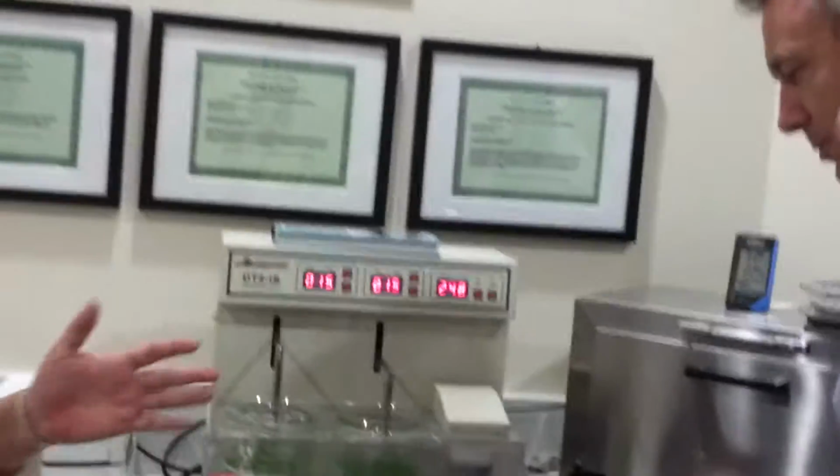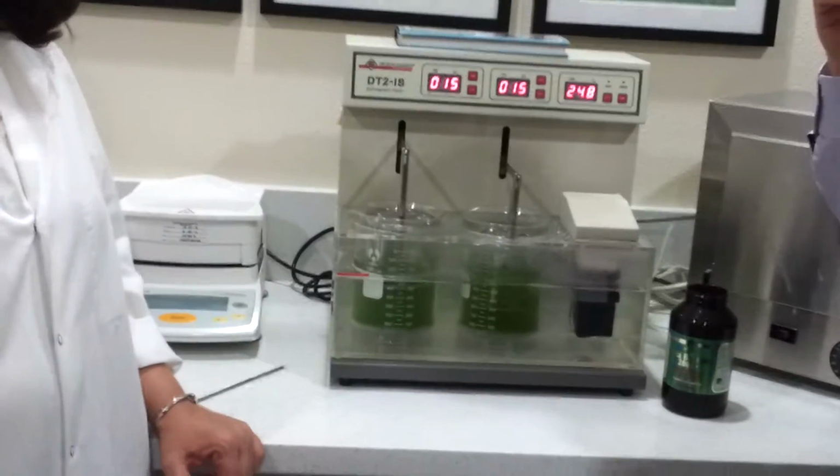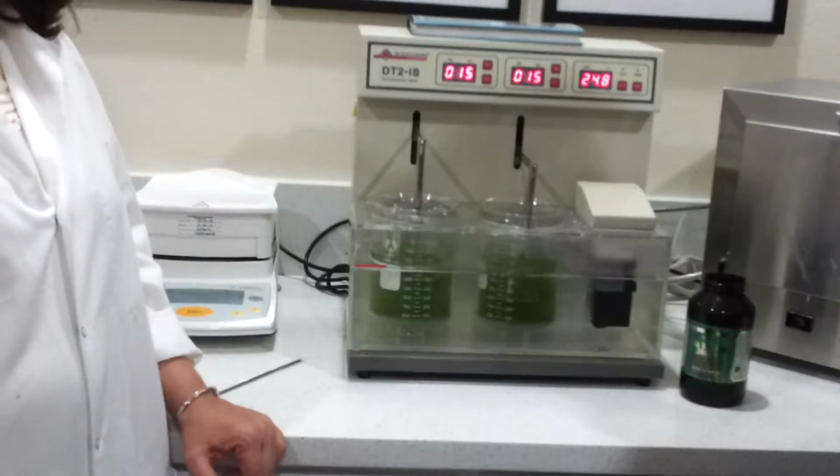Any tablet, any capsule, we check its disintegration time. Yeah, we have the test result, we record it. We run the test, we record all the data, and we can provide the results.